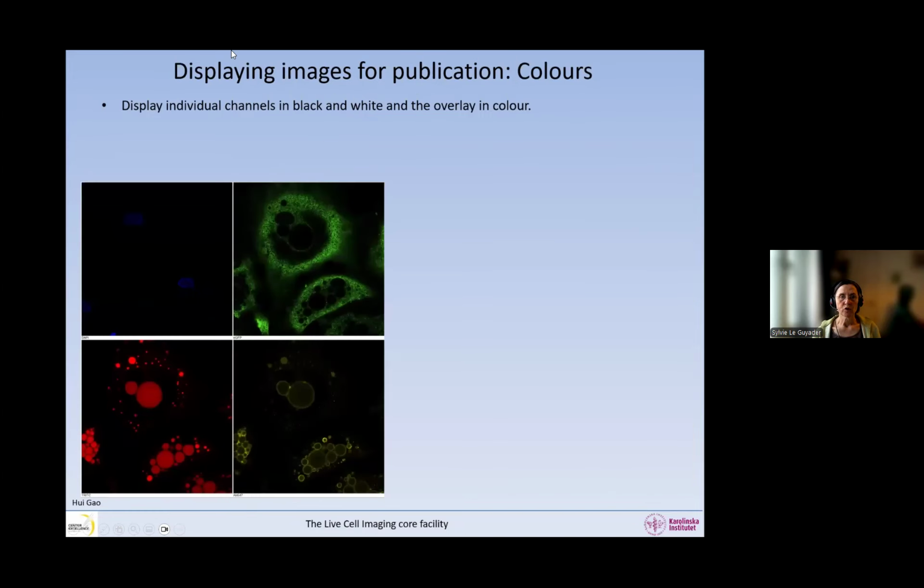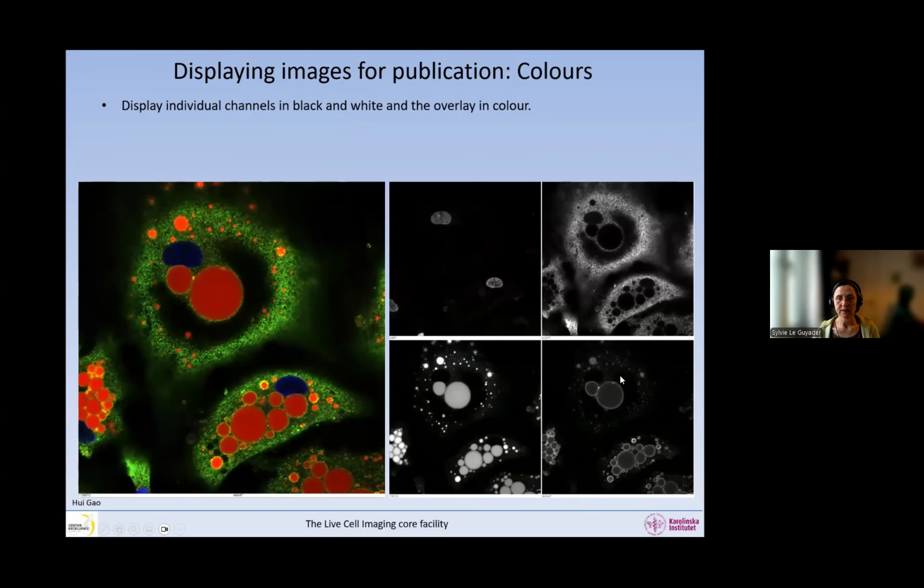So when it comes to displaying, I've said that before, display your channels in black and white. This is a lot more visible. We skip the color issue. And then there's the fact that our eyes are much better with green than other colors, so we have a bias in the colors. And also when you display your images, this is actually wrongly displayed, I must say, because the red should be magenta. And this is for people with color blindness. They would then be able to differentiate the green and the red.